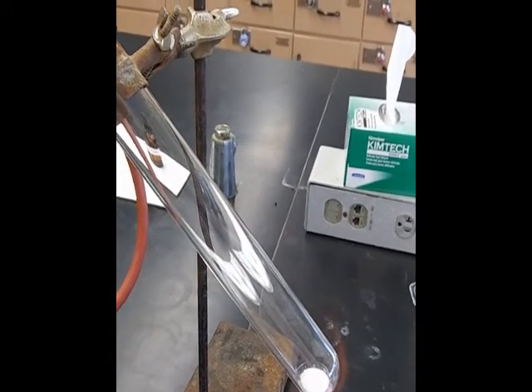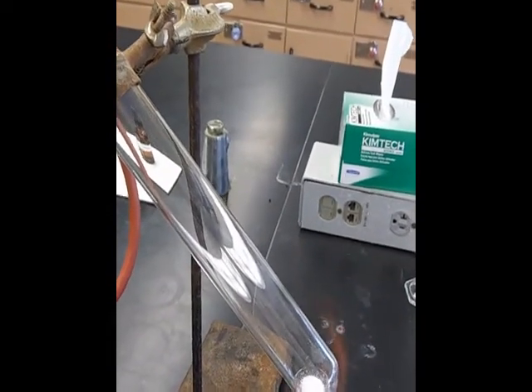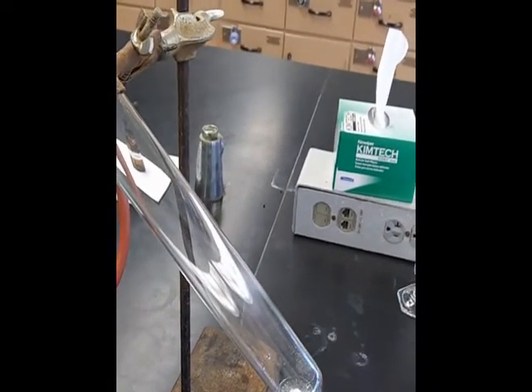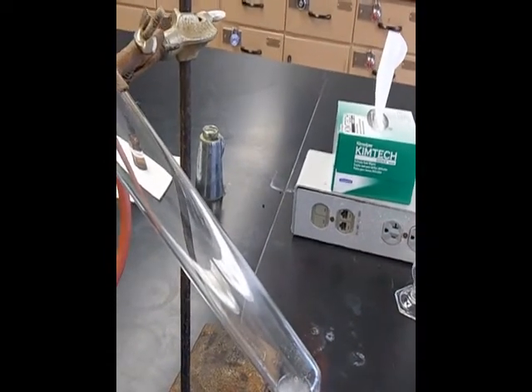And then it's going to start bubbling. Now it's not really boiling. It's producing oxygen, right? So the oxygen is forming the bubbles as it comes off. So you can see it's almost all melted now. There's some bubbles. I just got to kind of go back and forth a little bit, not heat it too fast.